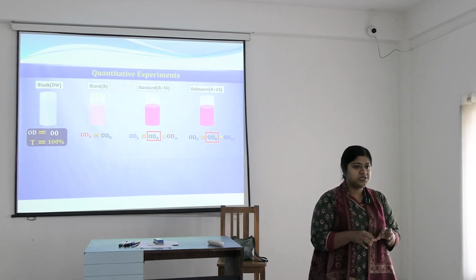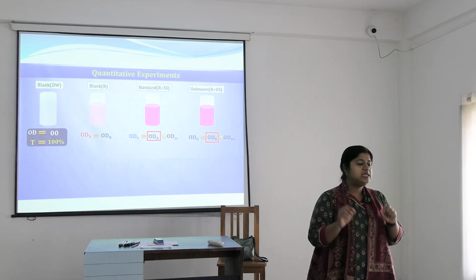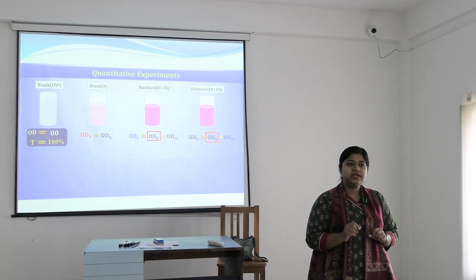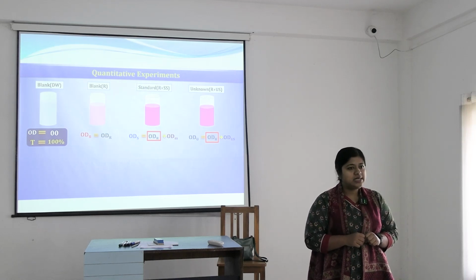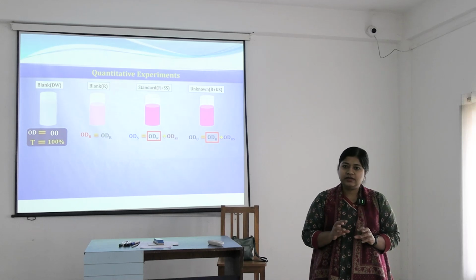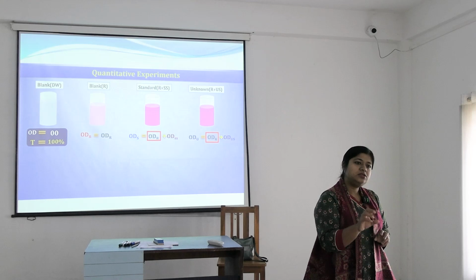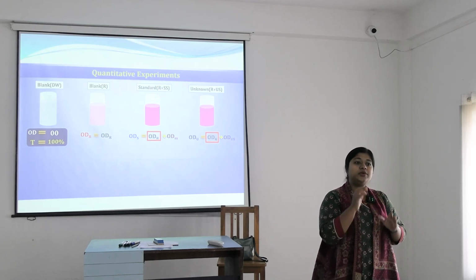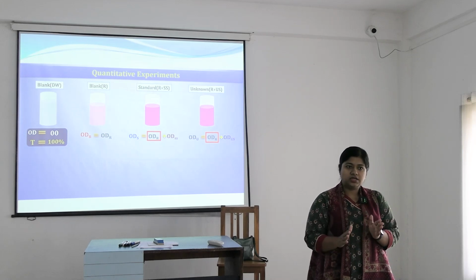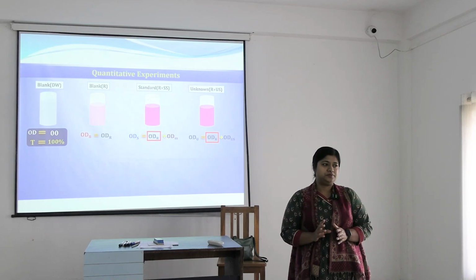So to run the reaction, we need reagent. Is a reagent always transparent? Tell me one reagent that is not transparent, a colored reagent you have worked with. Benedict reagent, another one sulfosalicylic acid reagent. So these are colored reagents. If we place a colored reagent, it will also give an OD. A colored reagent will itself give an absorbance. So to eliminate that error, we have to measure the reagent blank. Okay?